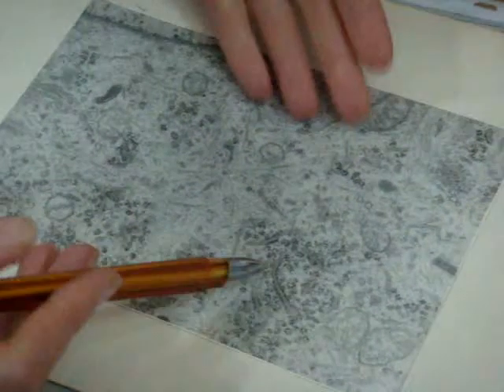Next. How many cells are here? One, part of one cell. Okay, let's look at what we can identify. This is a double membrane, part of the nucleus. Look, no heterochromatin, so it is a very active cell. Do you remember what the most active cells in our organism are that have light nuclei? Neurons and hepatocytes. Let's continue.